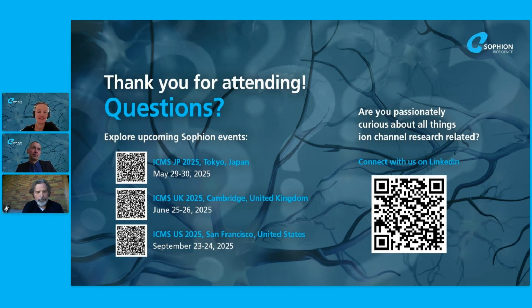Yeah, so with these cells, we haven't tried it, and in general, the culturing is required for their maturation. But we have actually previously tried it with iPSC-derived neurons, and it actually works. You can get them onto the cube and they patch, but they do have a very immature phenotype at that point and very small currents.